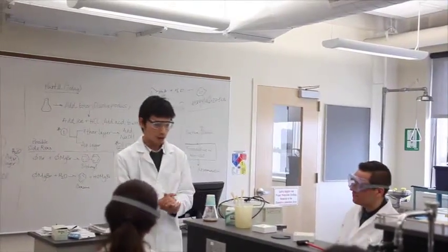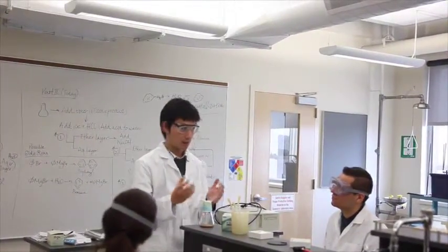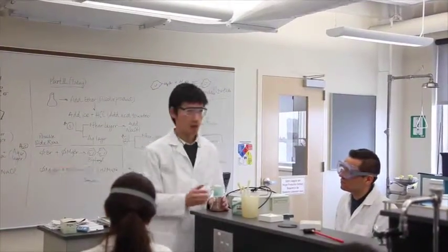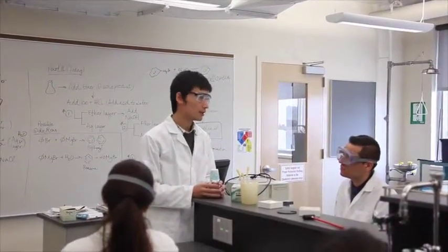So let's start. Also, the acid and the ether, the acid is really corrosive, so you need to wear gloves to protect yourself. We have gloves over there, and maybe on our side over there. That's good. All right, good.